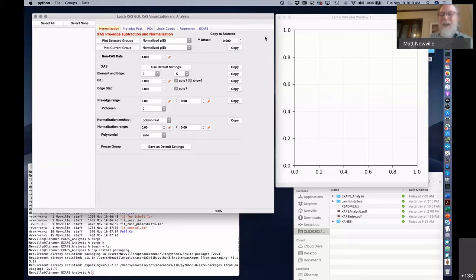Generally, for bare atoms and for most systems, even for insulators, there aren't very many P states available. There are a few select P states available that are bound, not in the continuum. Once you get above the threshold, you're in the continuum. If you're 10 volts above the edge, there aren't any unoccupied bound states that are still part of the atom, or there are continuum levels that swamp those bound states. But right at the threshold, or below the main threshold, there are these unoccupied states.